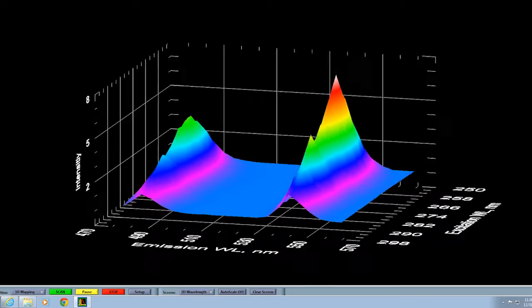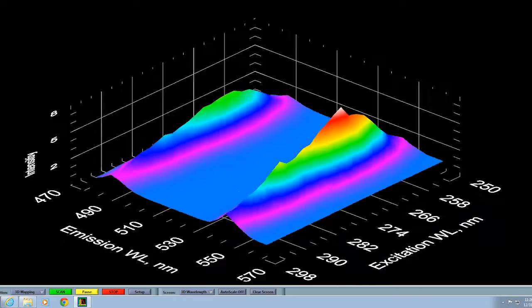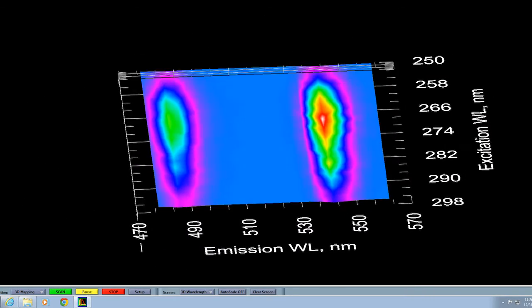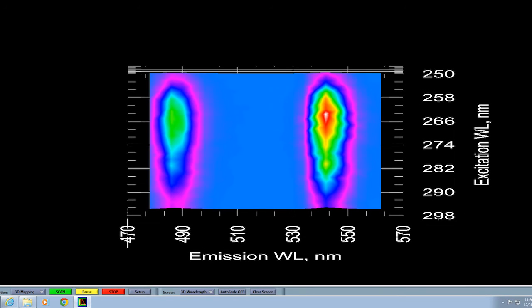Having collected the data now the user can interrogate that and look at it in the emission wavelength plane, in the excitation wavelength plane, or as is quite often reported looking directly down on the data looking at both XY and where those wavelengths all cross over.